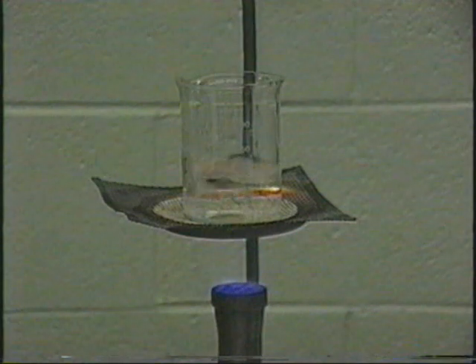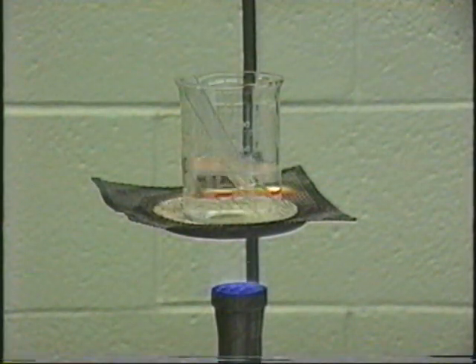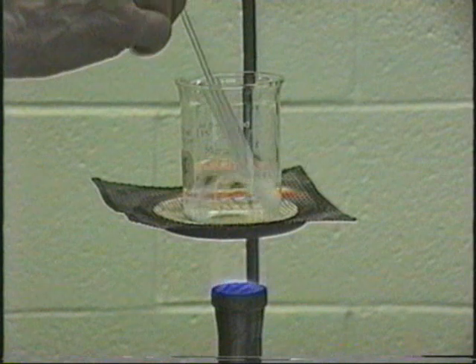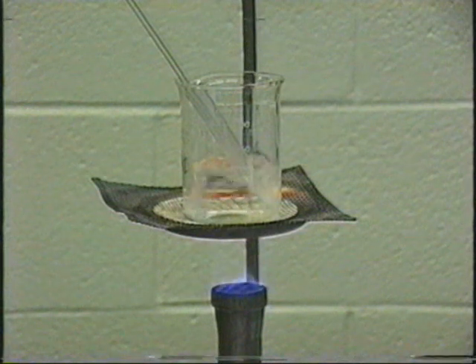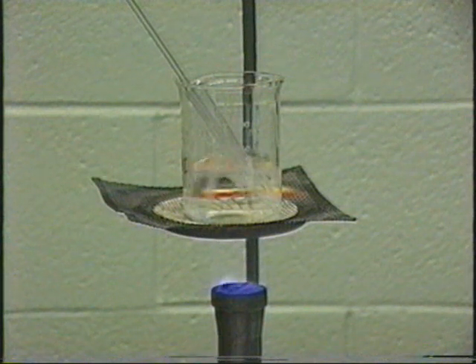All right, we'll use a boiling water bath to heat the sample here. Don't forget to use a stir rod to make sure that everything is mixed so that all the lead chloride, if any is in there, will dissolve. And also, don't forget, when you're centrifuging and decanting the supernatant liquid, make sure the solution is still hot so the lead chloride remains in solution.